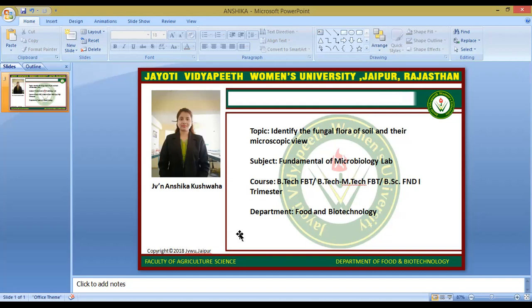This is the technique for identifying fungal flora. We can also perform an antibiotic sensitivity test, for which we require paper discs, prepared bacterial plates, and an antibiotic such as penicillin. This is the basic procedure by which we can inoculate the fungal flora or bacterial sample from the soil.